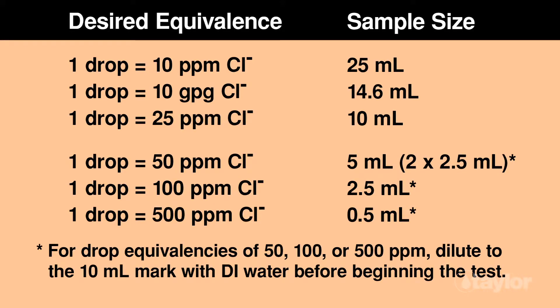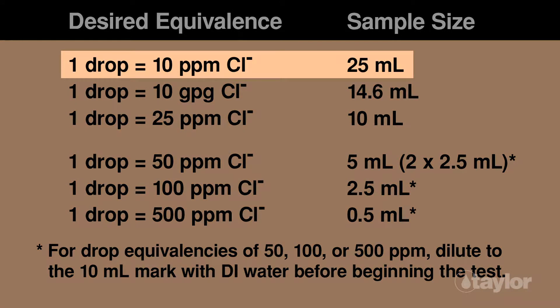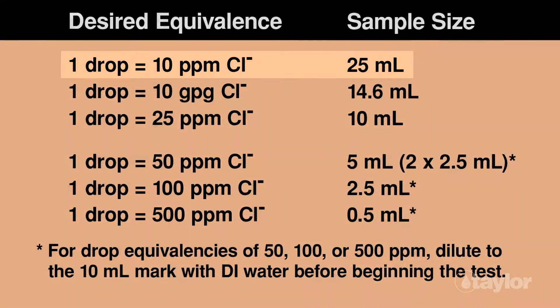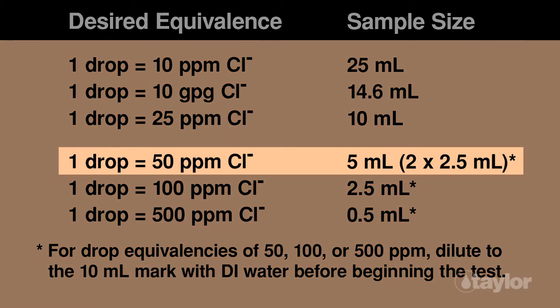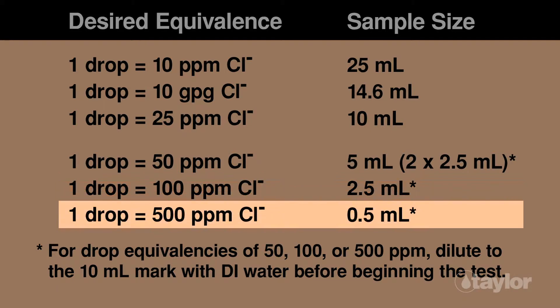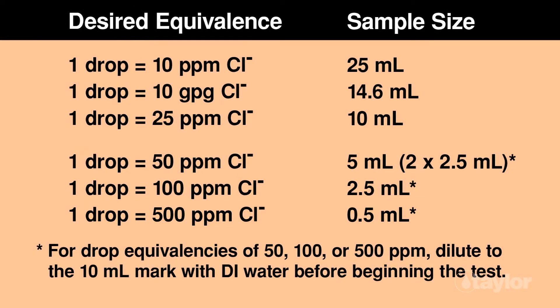For this demonstration, we will be using a 25 ml sample with a drop equivalency of 10 ppm. Taylor's K1549 also allows options and drop equivalencies appropriate for other sample sizes. Note: for drop equivalencies of 50, 100, or 500 ppm, dilute to the 10 ml mark with DI water before beginning the test.